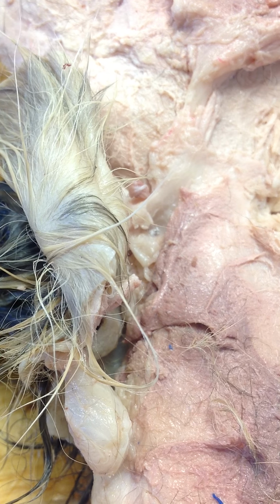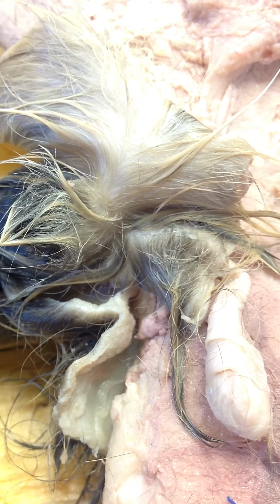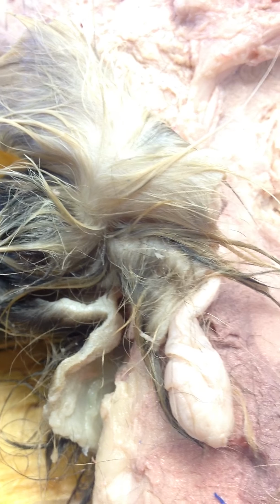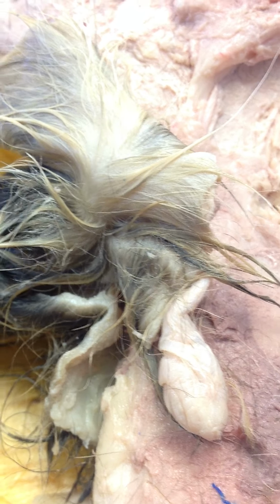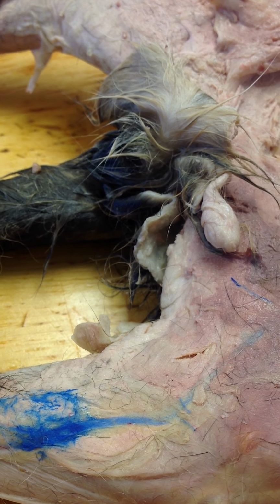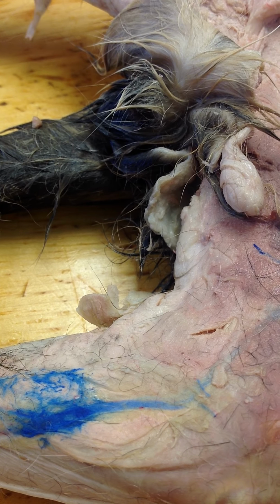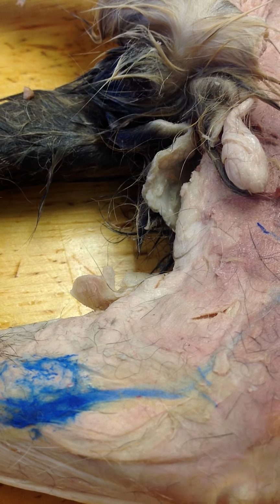Okay, penis. Behold the penis. It's covered with fur. Corpora cavernosa. We didn't go through all of that. The corpora cavernosa is the inside of the penis. Corpus spongiosum, I'm guessing, is also inside the penis. Erectile tissue located at the ventral surface of the penis, in the groove of the corpora cavernosa.